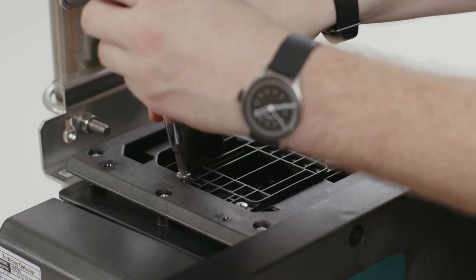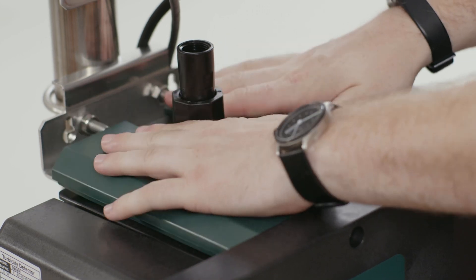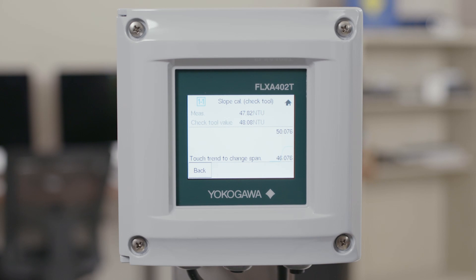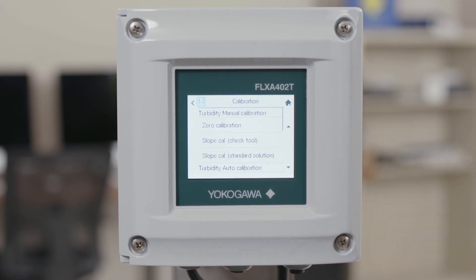Once you have this tightened down, go ahead and put the green cover back on and wait for your measurement to stabilize. Once it's stabilized, press check stability and give the analyzer some time to run a stability check. When next appears, you'll see the measured value and your calibration value. By hitting next it will calculate the slope and show you your corrected measurement value, which should match your check tool. Click accept and you have now stored your span calibration.